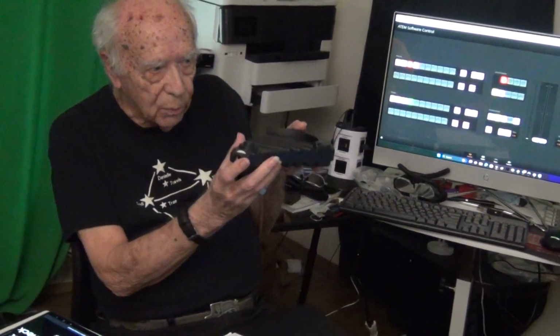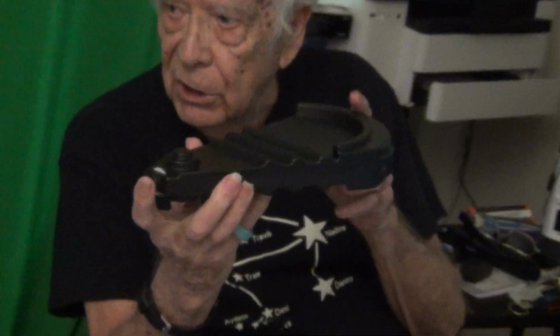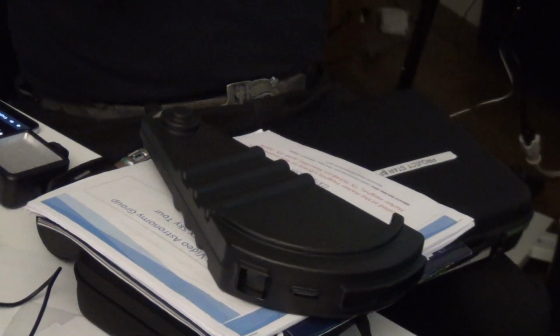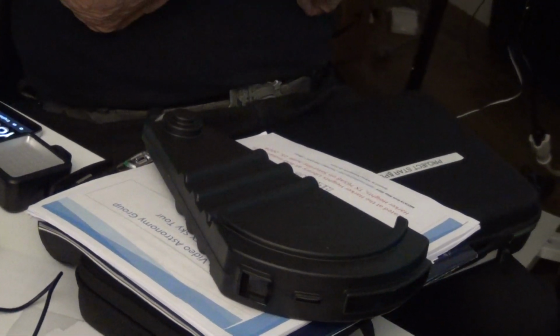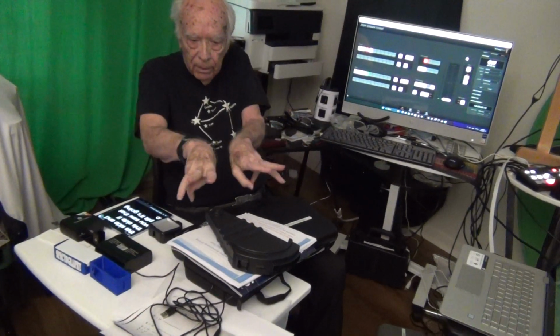Now, here, let me think how to do it. This is kind of what I want you to draw. You have a light source somewhere here. You're looking at it. The diffractor, if you look straight, Lisa, listen now. If you look straight, you're going to see more than likely just white light. You got it? Okay.